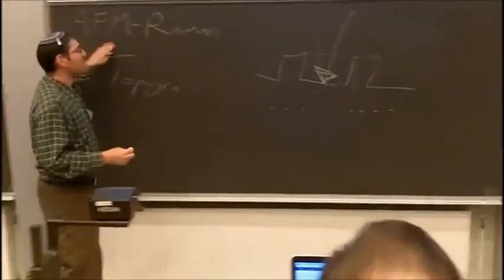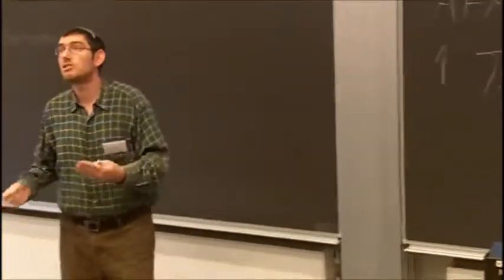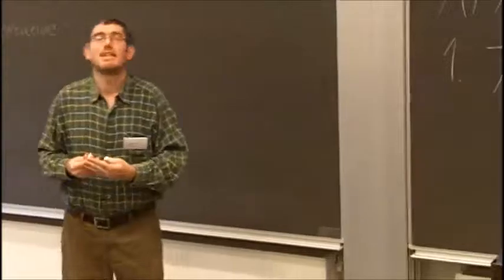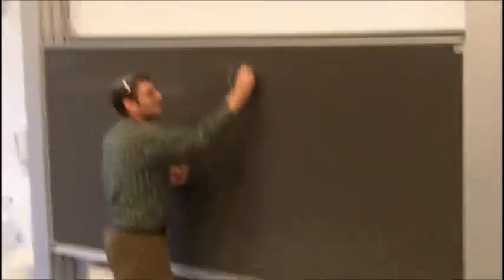So that's just AFM. There was another thing we talked about yesterday, that's called TERS, which we also integrate with Raman. Now, does anyone remember what TERS stands for?